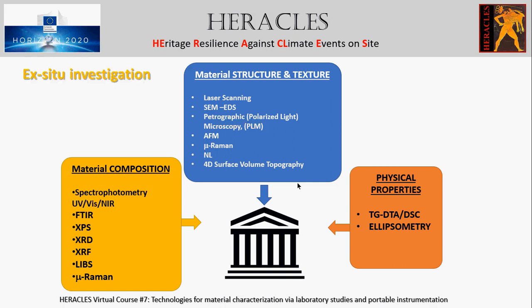Also, in the study of the material's composition, laser-induced breakdown spectroscopy can be applied both in laboratory and in situ environments, and gives qualitative and semi-quantitative analysis without prior or special preparation of the sample.